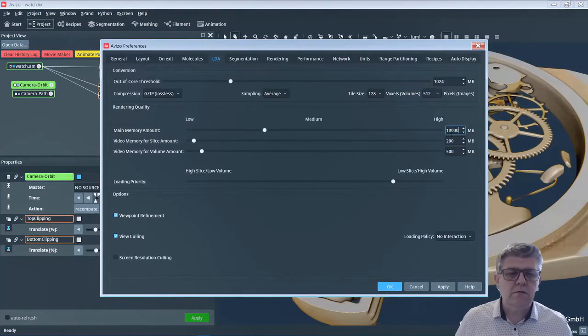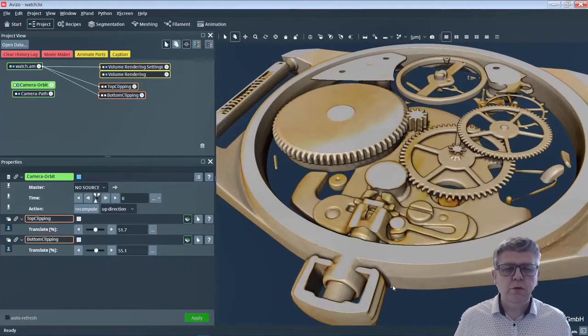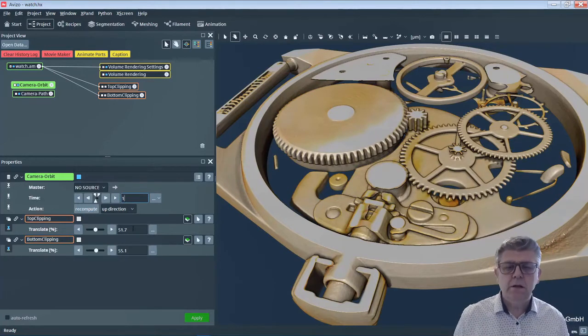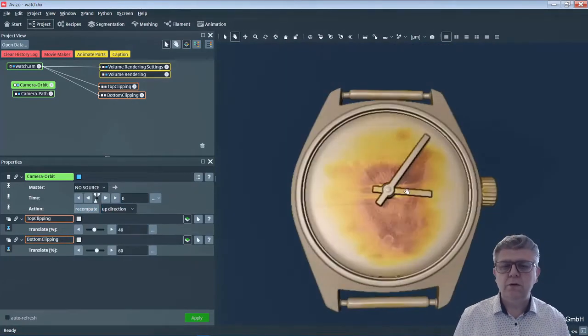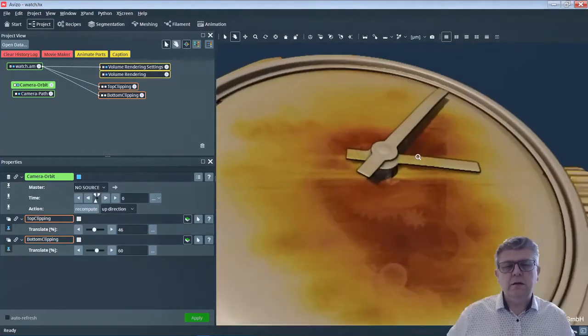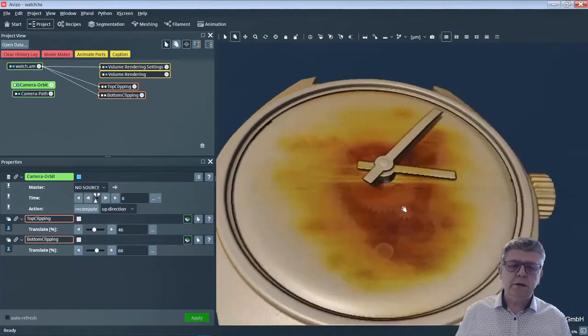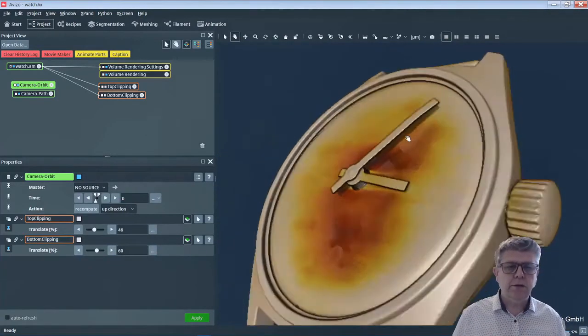In this case, increase the default basically. So like it's 8 gig, I give 3.5 in GPU and 10 in RAM. So now I should have enough memory dedicated to visualization to avoid artifacts. Okay, so again I'm going to mimic my animation for my video. Zoom in and out a little bit. Okay, this seems okay.